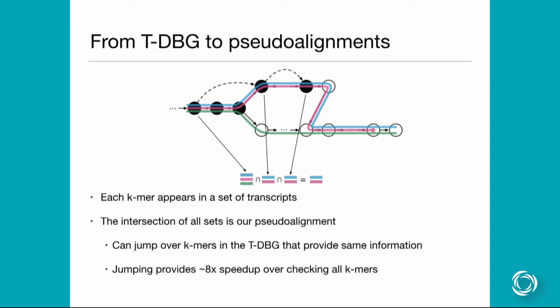If you were to do this, you'd have to cook up your own analysis. I'm sure there are SNP pipelines that do this type of thing, but it would deviate entirely from the type of analysis that we're talking about today. Does that answer your question?